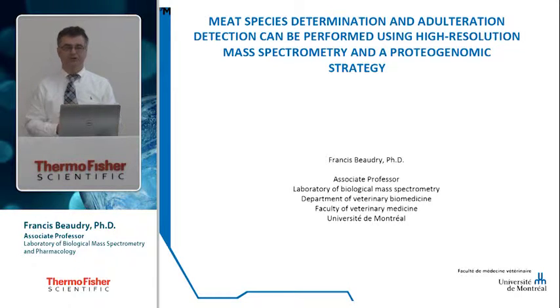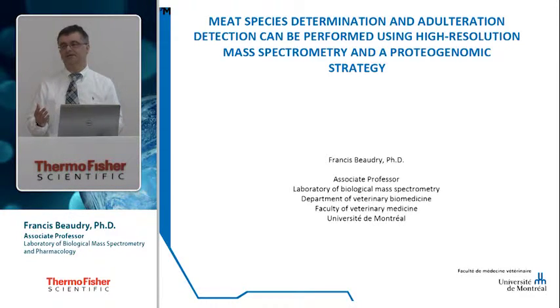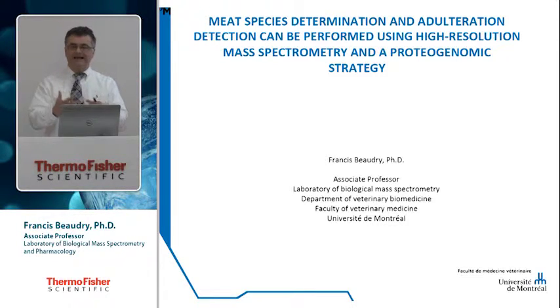I'm not sure what your experience in proteomics is, but generally in proteomics, we're very prone to identify a large amount of proteins, but there is very little explanation of the real role of those proteins in the biological system. So that's a challenge today in proteomics. We're very good at identifying proteins, but not very good at explaining the biology. So targeted proteomics avoids all this technical aspect, and we can really focus on what is really needed to understand within our sample.